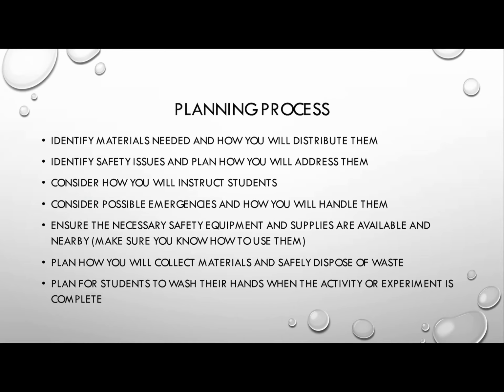Well, one, you'll need to identify materials needed, how you will distribute them, identify safety issues and plan how you will address them, consider how you will instruct your students, consider possible emergencies and how you will handle them, ensure that the necessary safety equipment and supplies are available and nearby, and also make sure you know how to use them, because a fire extinguisher is great until you don't know how to use it, and then it's just a useless fire extinguisher. Plan how you will collect materials and safely dispose of the waste.